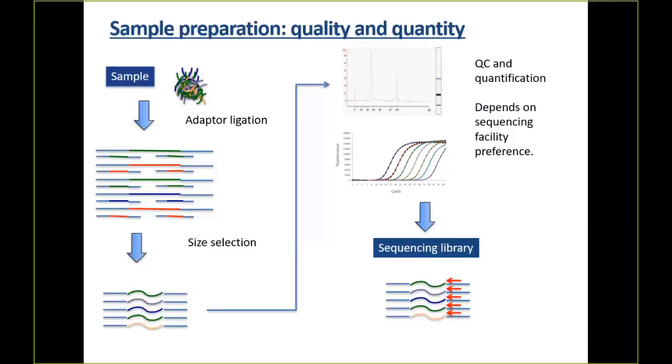So what is the essence of library prep? Library prep is going to vary by method. If you're doing microbiome, for example, especially if you're looking for 16S sequence, your library prep is probably going to involve selectively amplifying 16S sequences from bacteria. It's also going to involve lysing bacteria. And any one or all of those steps can potentially introduce bias or mess with your final result.